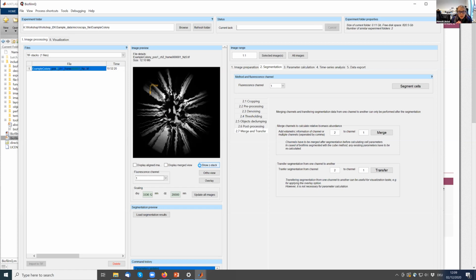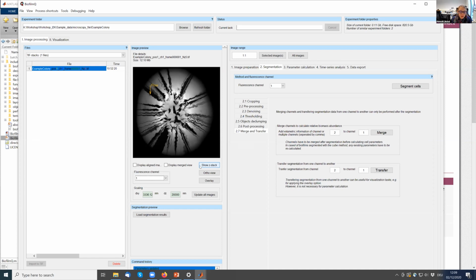And now what does this abundance mean? If you think of a cube which is, for example, partly filled with cells that are fluorescent in the red channel and cells which are fluorescent in the green channel. Maybe it's filled half-half, might be filled 75 to 20, might also be that 20% of the cube is filled with one color and 20% with the other color, and the last 60% is kind of empty, there are no cells at all.